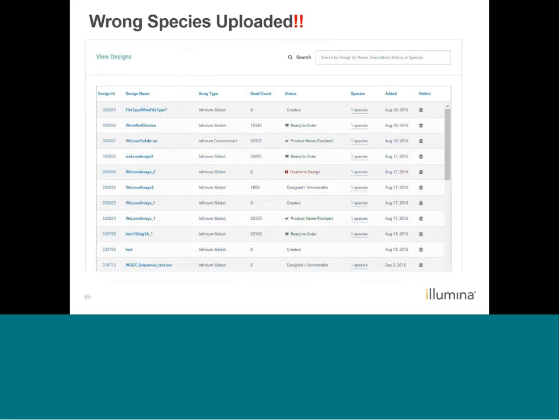So what we get is the design is ready to order, even though we uploaded the wrong species. So I'm telling you this as a tale of caution. Make sure that you're uploading the correct species.